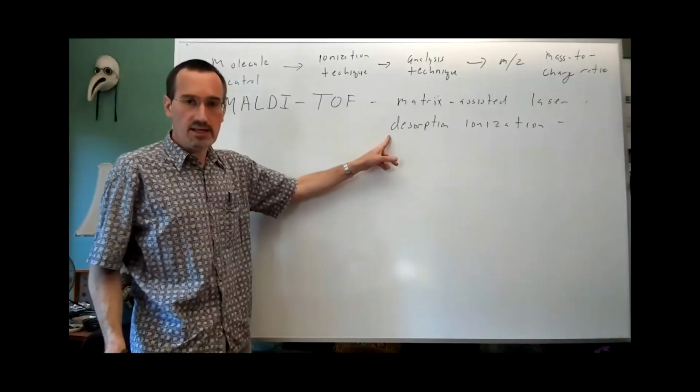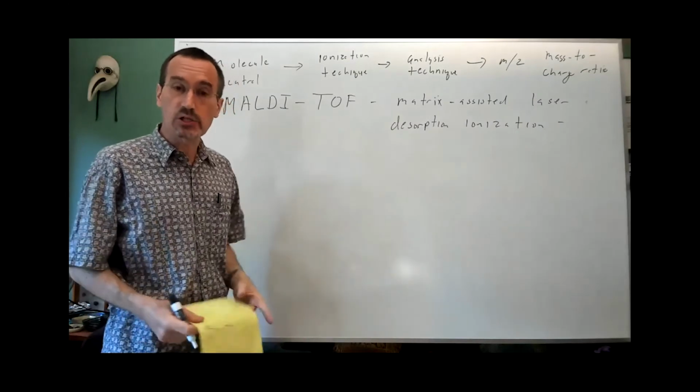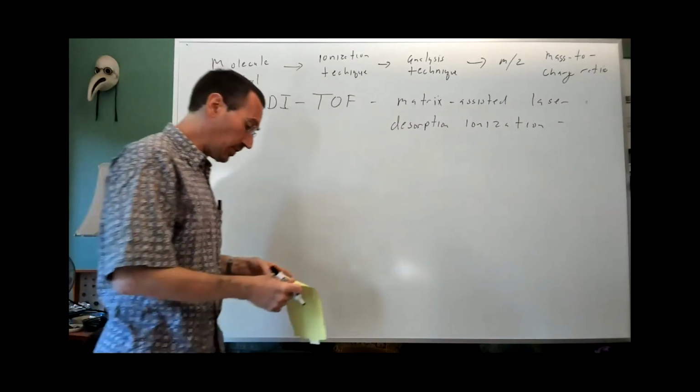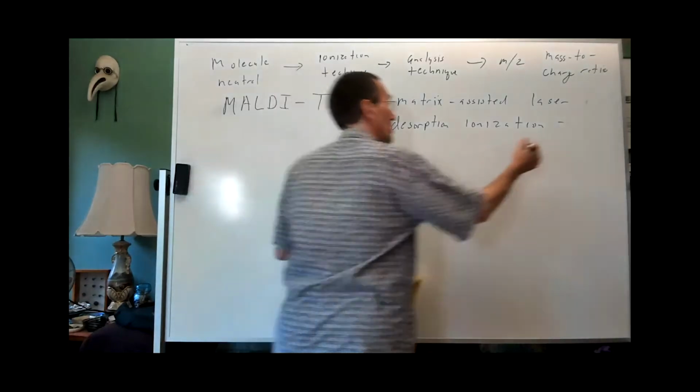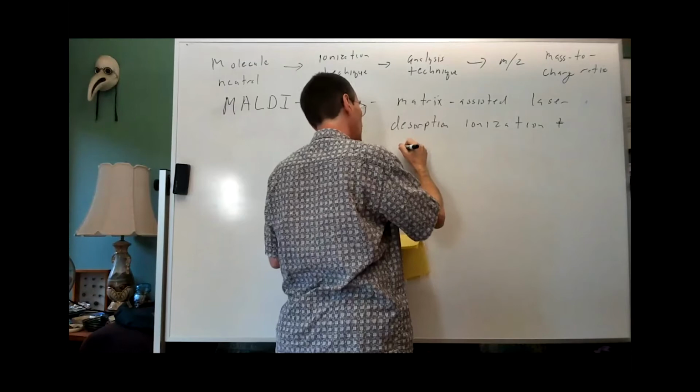And then you're measuring how fast the molecule moves, which basically represents the acceleration across charged plates. So you're using, I'll say, plus time of flight analysis.